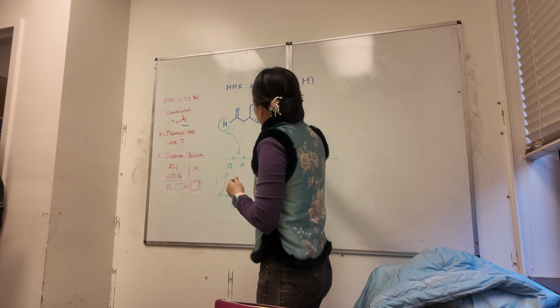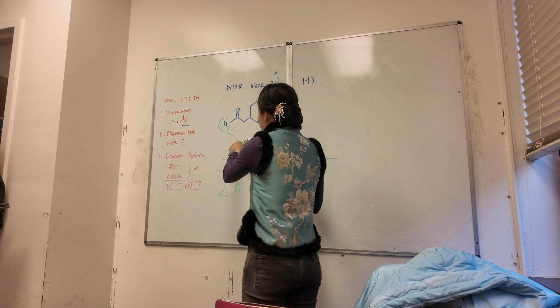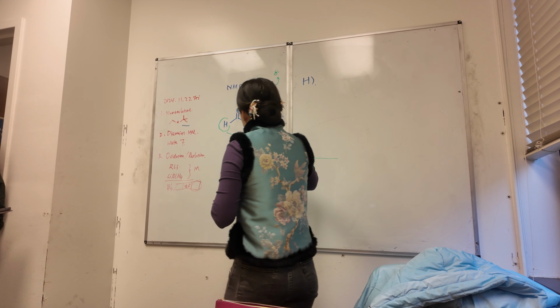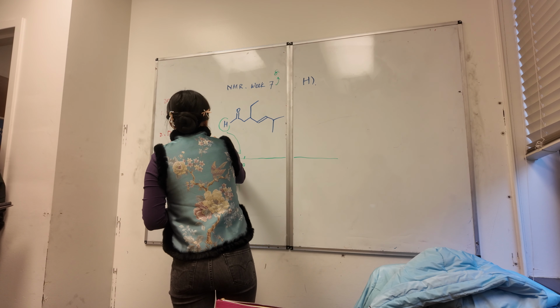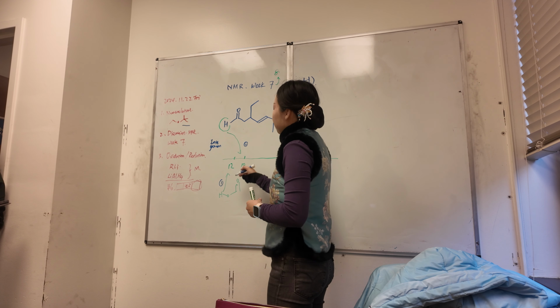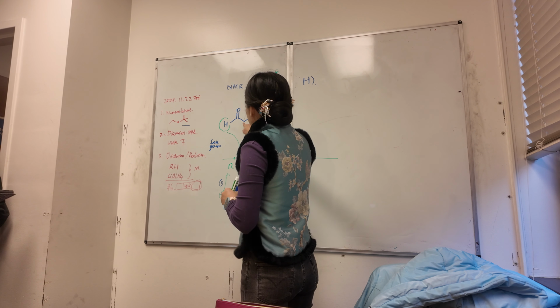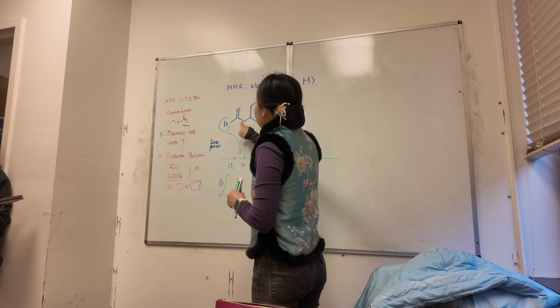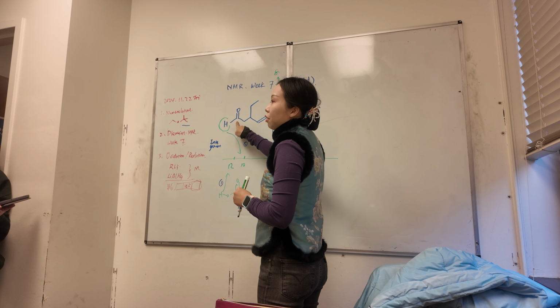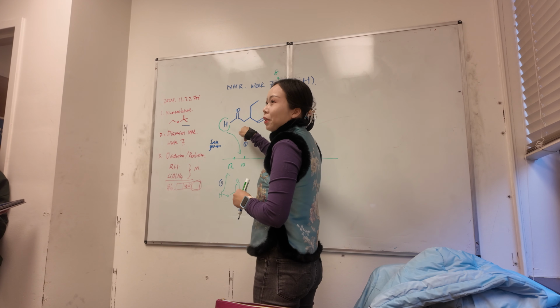Okay, integration will be blue, so we'll use blue. Where is this peak? We'll use green, because that's week 8. Okay. Integration. Okay, 1. This one will be 1, but it's not part of the game, so we'll do it later. Are we good? All right. What we have here is 2 hydrogens, right? And those are the hydrogens next to sp2, next to something that will change its ppm, change its shift. Okay, which way is it going?